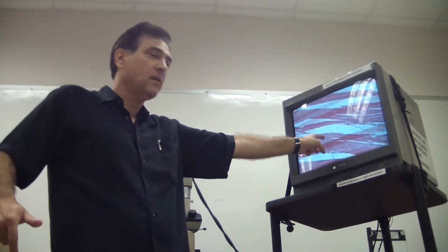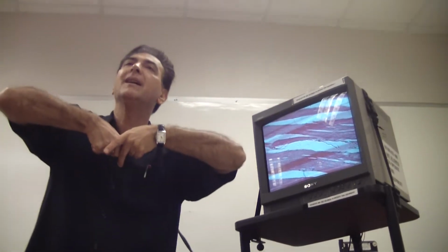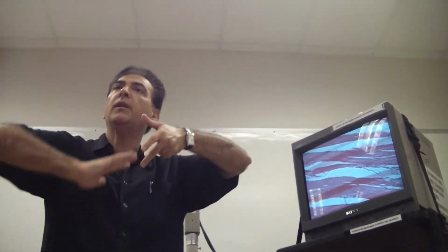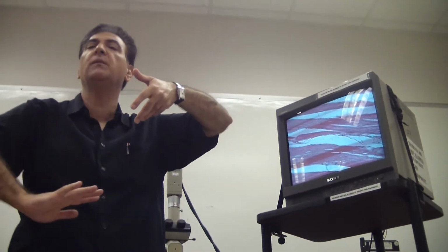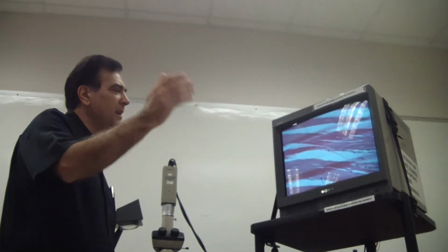See there are striations? That's your skeletal muscle. Those are not smooth muscle. So at the very beginning, you actually have skeletal. But the great portion of it is actually made up of smooth muscle.